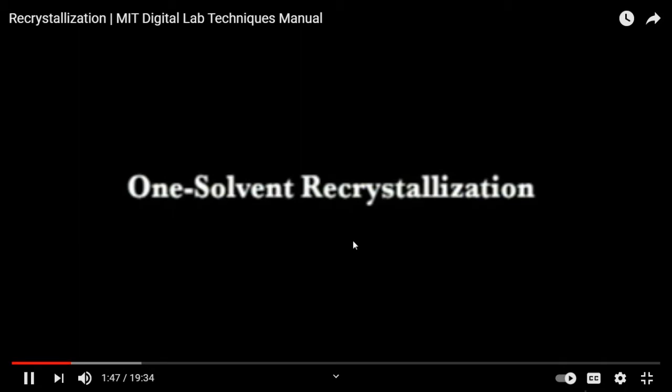Carrying out a one-solvent recrystallization of naphthalene, followed by instructions for adapting the procedure to a two-solvent recrystallization. Choosing an appropriate solvent for a recrystallization is a very important step. You won't get acceptable results if you don't pick carefully. It is helpful to have a variety of solvents at your disposal.